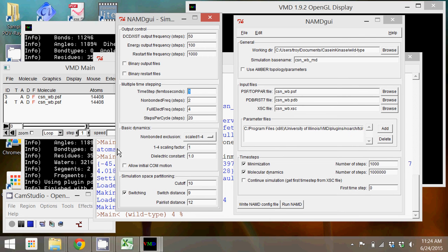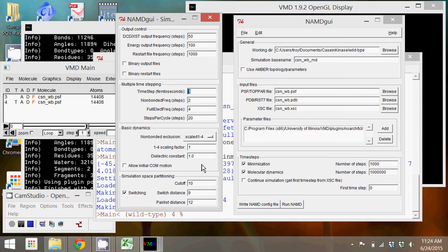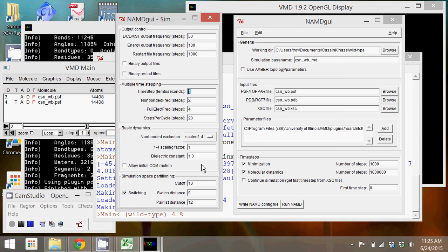You can also tell it how often to recalculate some of the particular interactions, like interactions between non-bonded atoms or electrostatic interactions. We're just going to leave all of these at the default settings. Same thing goes for the basic dynamic parameters. You can determine where the program stops calculating particular interactions, like van der Waals forces.